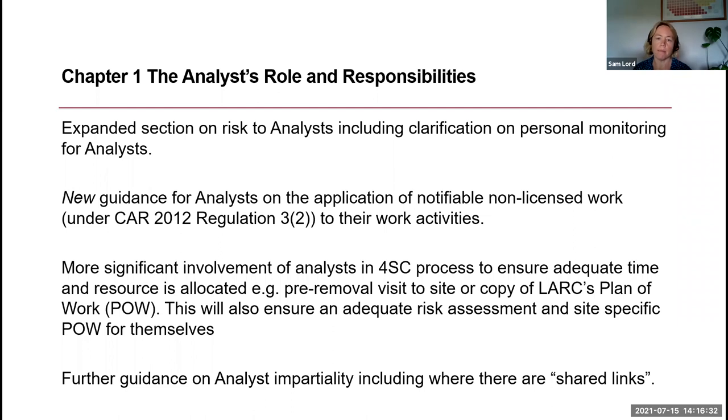There's guidance for when analysts' work activities may be notifiable non-licensed work, so what sort of examples they may be.